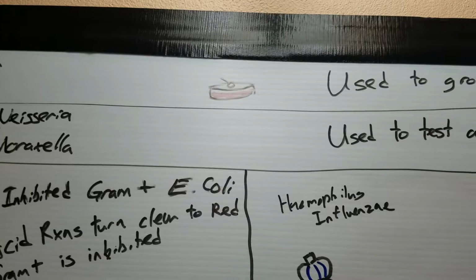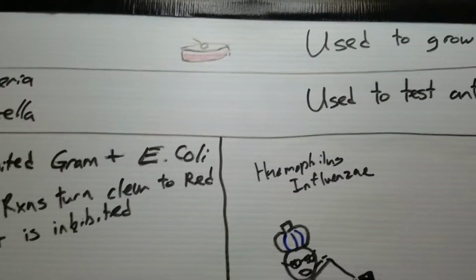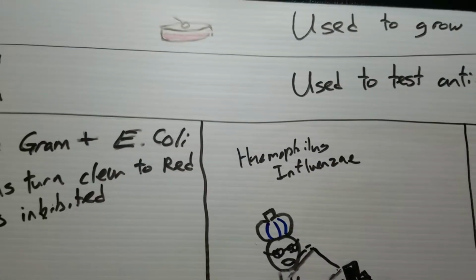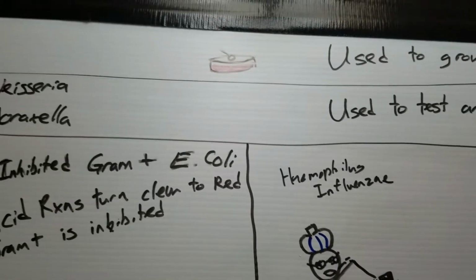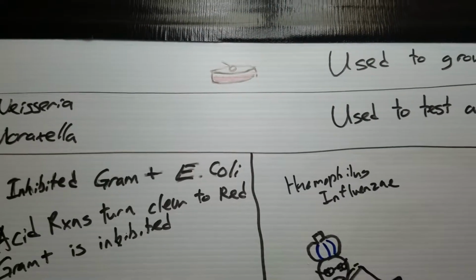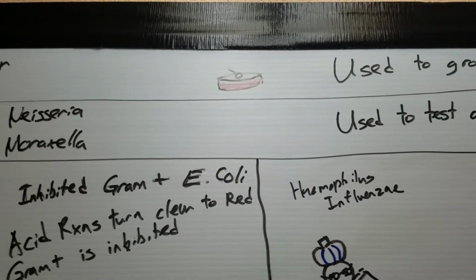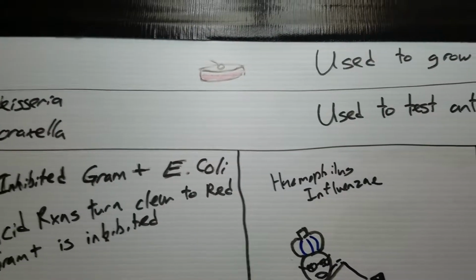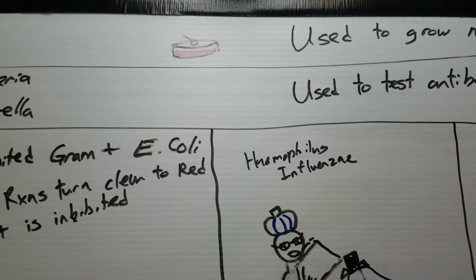Now there's certain ways that you can treat this agar plate to differentiate and see what's actually growing there, because if you just swipe it, there's certain bacteria that might take over and you won't be able to see the pathologic bacteria because of the bacteria that are native to the mouth that are out competing that bacteria. There might be certain bacteria that are more difficult to see without certain stains and things of that nature. So let's talk about exactly how we get down.